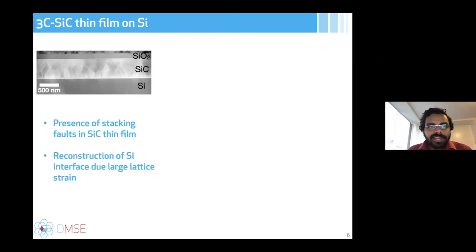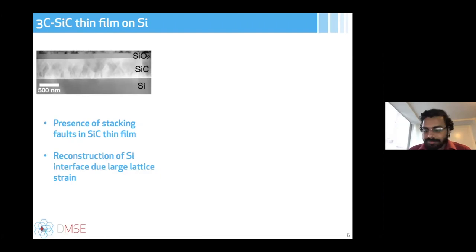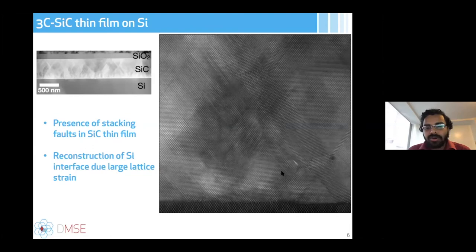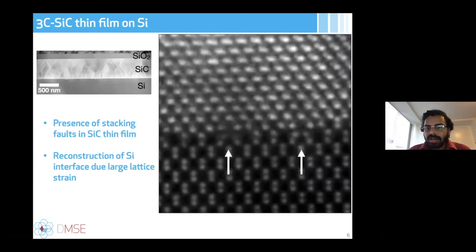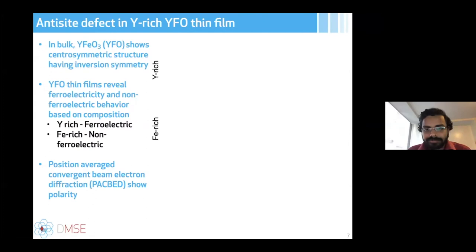Currently I'm also working on silicon carbide, investigating what dopants can be introduced to achieve qubit or other properties. Here is an image of silicon carbide grown on silicon — this is 3C cubic silicon carbide, which grows with many defects due to the large lattice mismatch between silicon and silicon carbide. We also found that while growing on silicon surfaces, silicon likes to reconstruct first at the interface, with silicon dumbbells tilting at the SiC/Si interface.